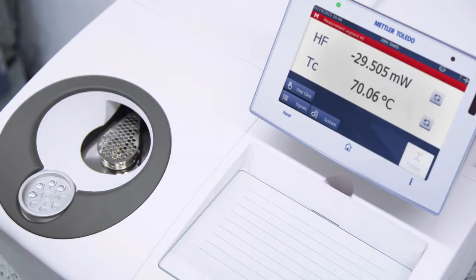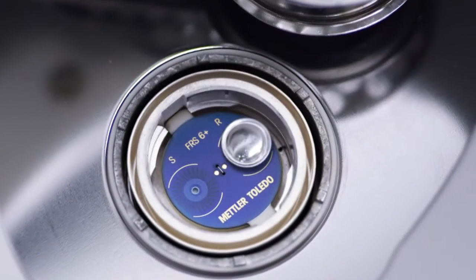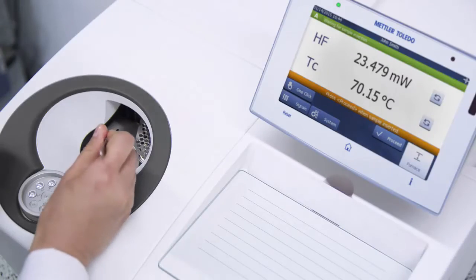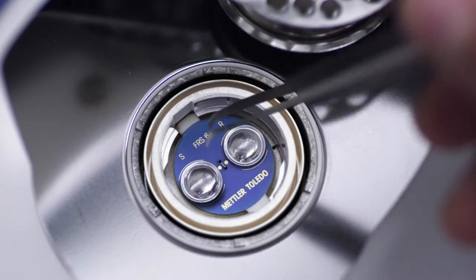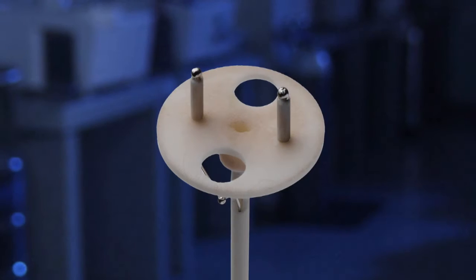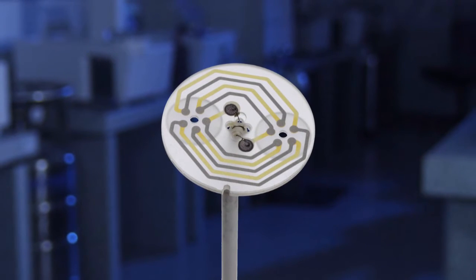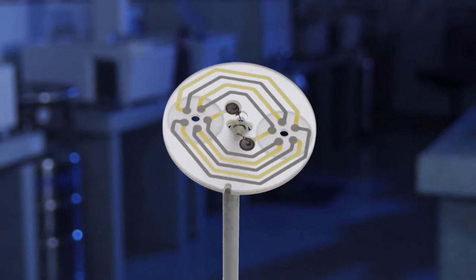The heart of a thermal analysis instrument is its sensor. Mettler Toledo's pioneering research and innovation have continually improved sensor technology, from the first TGA DTA sensors in the 1960s to the sensitive glass sensors with 10 thermocouples in the 70s.